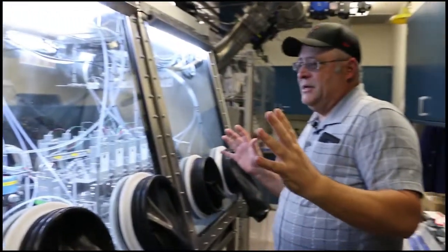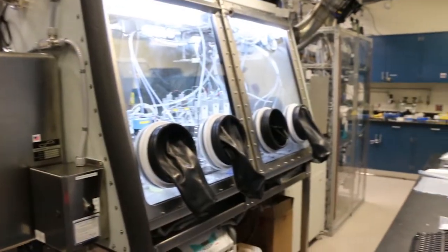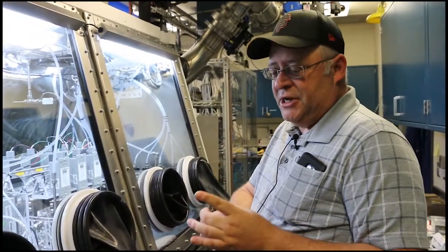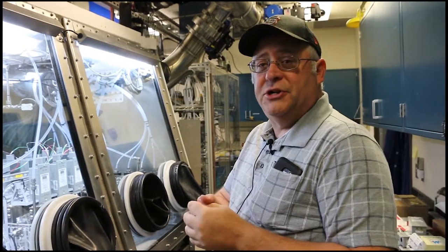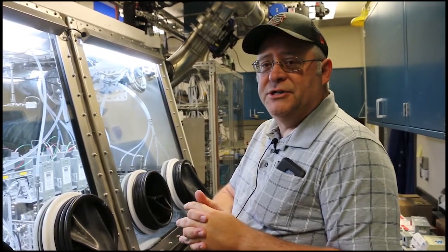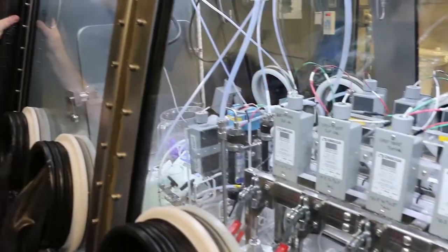What we have is a fixture that tests pieces of material inside Swatch cells, and we test the permeation under chemical warfare agents and other toxic industrial chemicals.